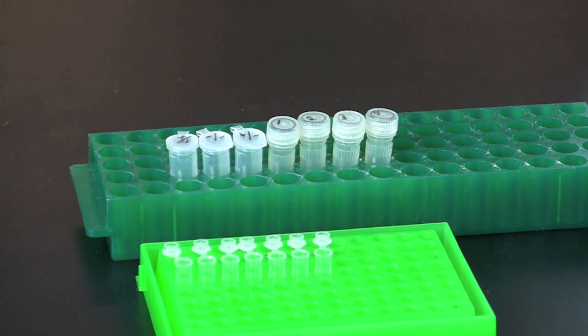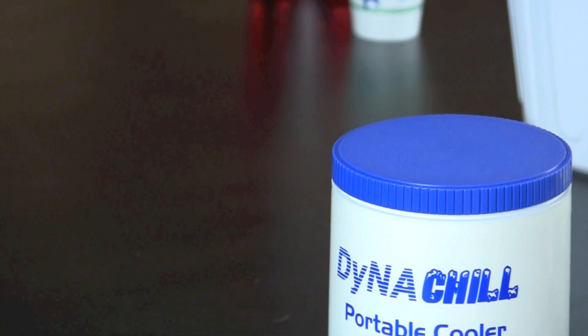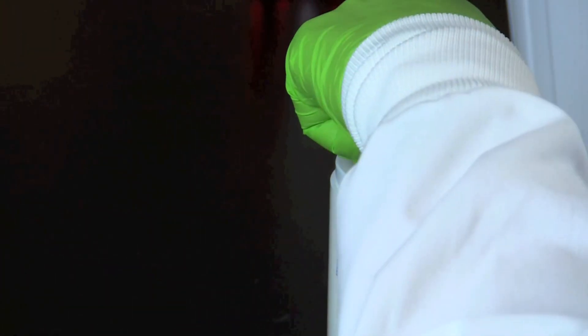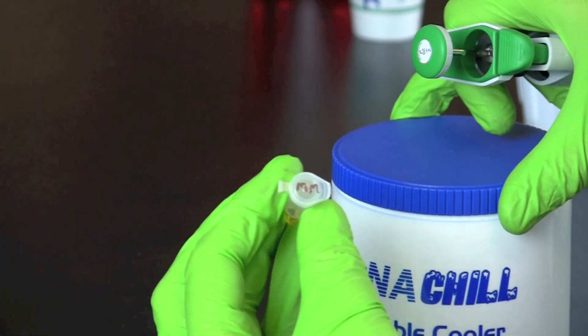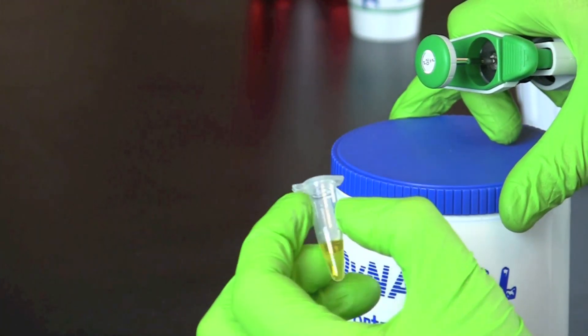Each group should also have a set of PCR tubes labeled to match the DNA template samples. Pipet 20 microliters of master mix into each of the PCR tubes.